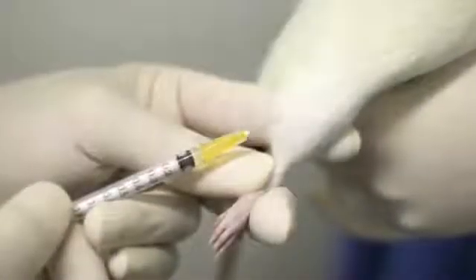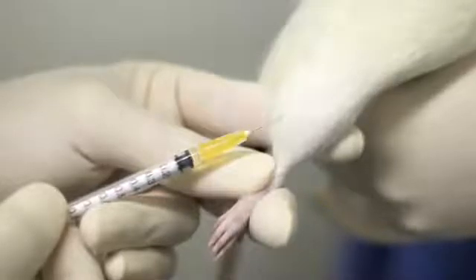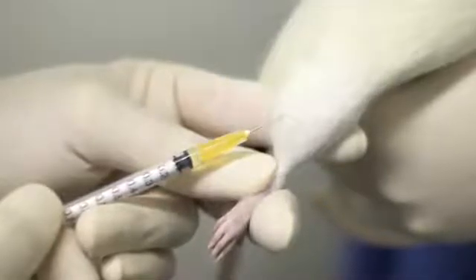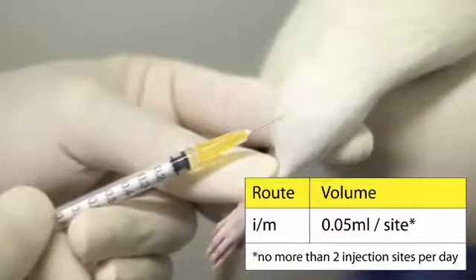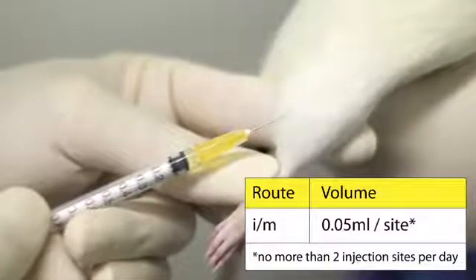Intramuscular injections can be made into the front or back of the rat's thigh. It is important that only small volumes are injected by this route, as distention of the muscle by larger volumes of material can be painful.